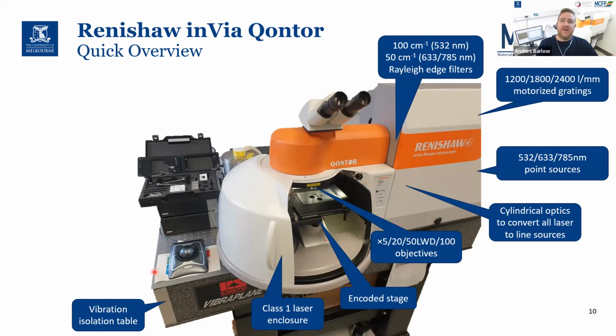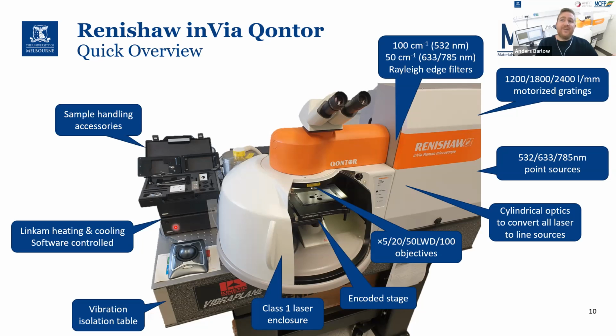And then the entire system is sitting on a passive vibration isolation table as well. We have Linkam heating and cooling cell for this instrument that is software controlled. And we have some fairly nice sample handling accessories here. So we can be very flexible in the way that we can work with a broad range of sample types.